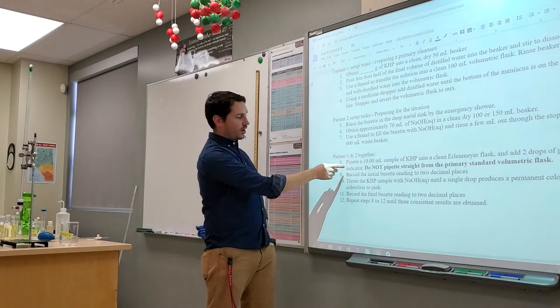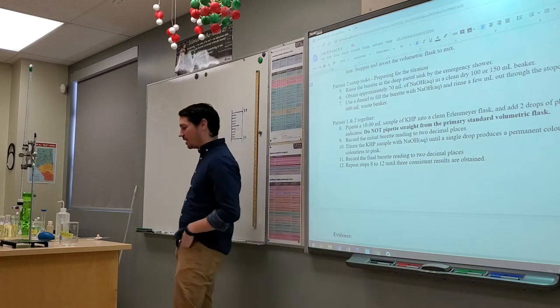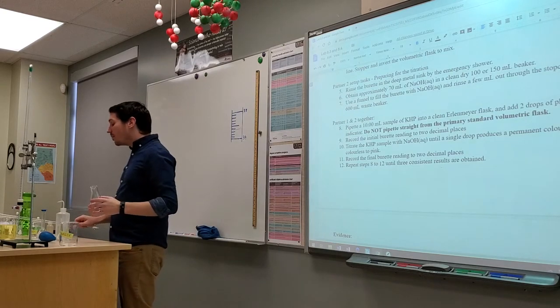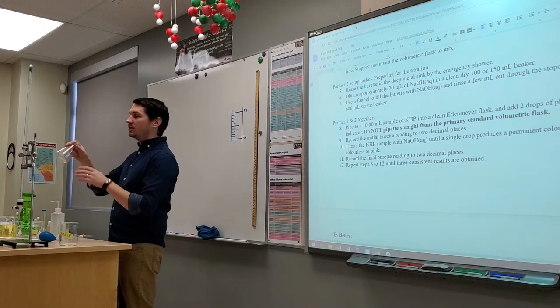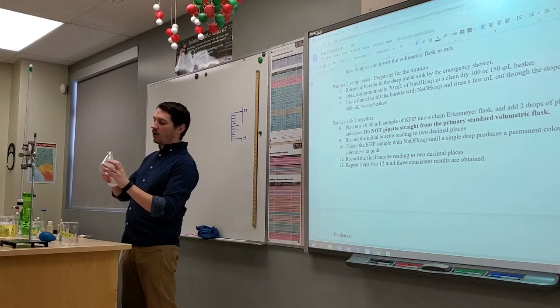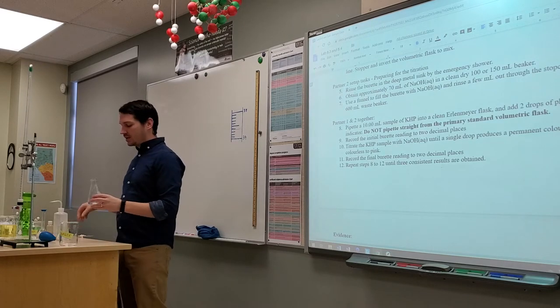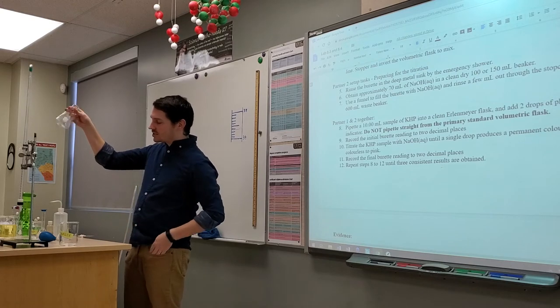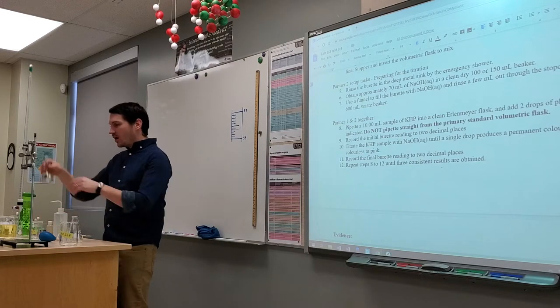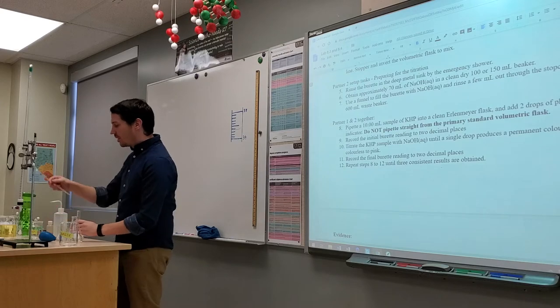Now what do we got to do? We got to pipette a 10 milliliter sample of KHP into a clean Erlenmeyer flask. So I've got my clean Erlenmeyer flask. You probably should, at the very least, rinse it out with distilled water first. By the way, it doesn't matter how much distilled water is in your Erlenmeyer flask, and I'll talk to you about why that is here in a little bit. So I'm going to at least rinse it out and dump it into a waste beaker.